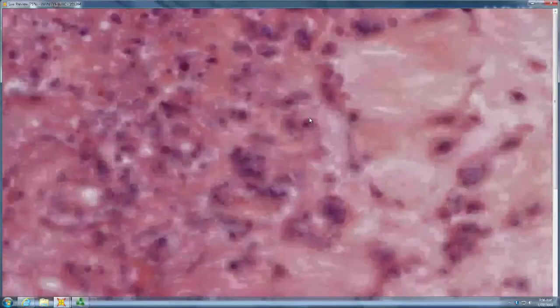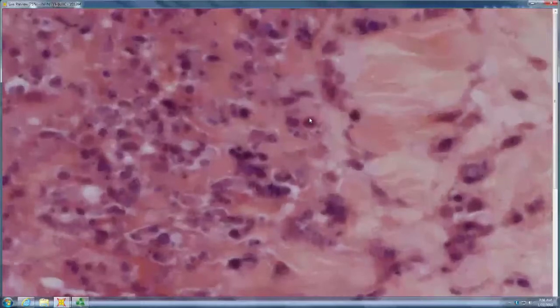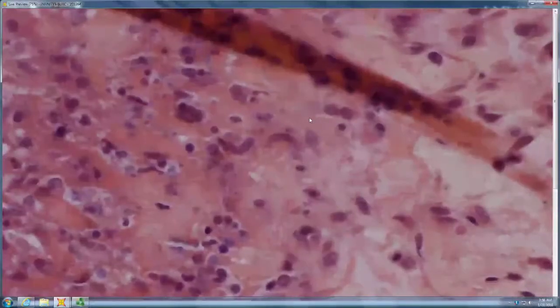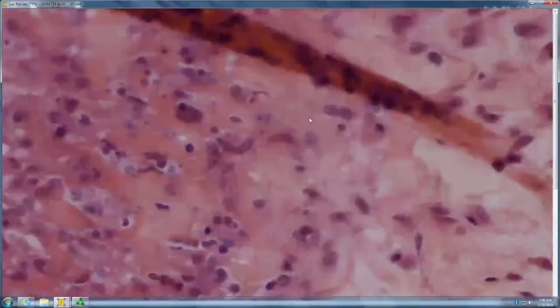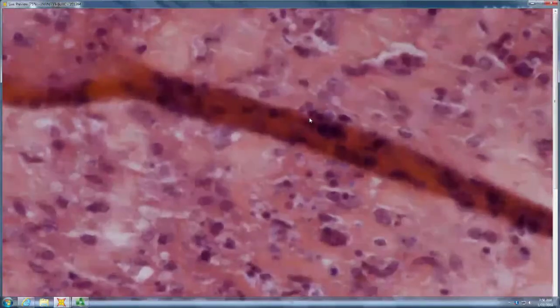Maybe some red hollow swellings. Or am I seeing the wrong thing? A lot of them are gray, not hollow. See that big gray thing, like an eyeball? Maybe like a soccer ball as well. At the end. Let's look around and see if we see morula-like structures.